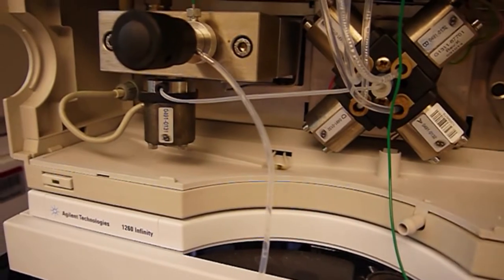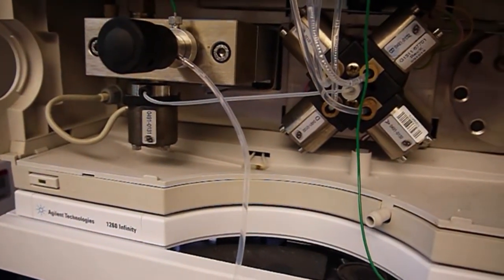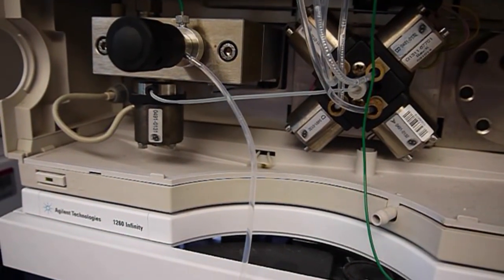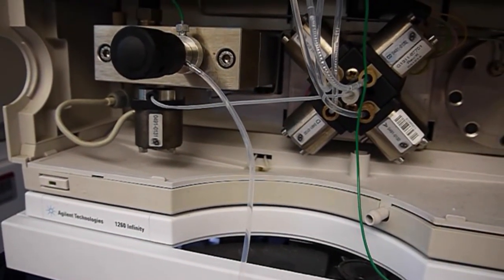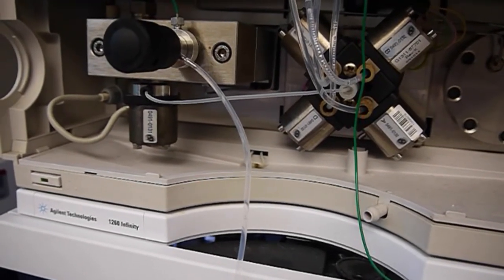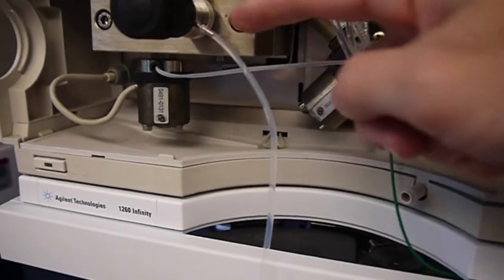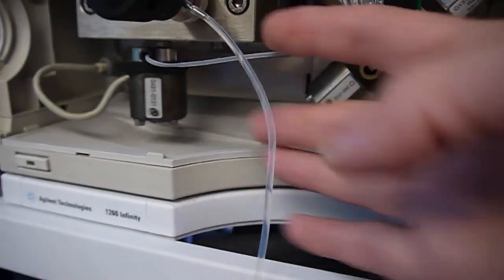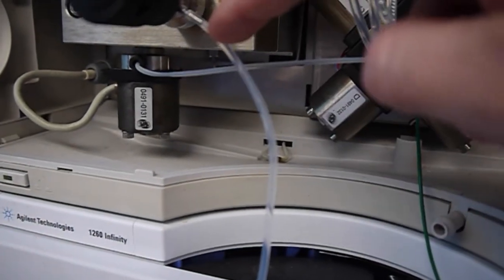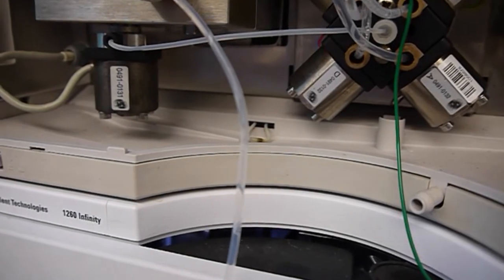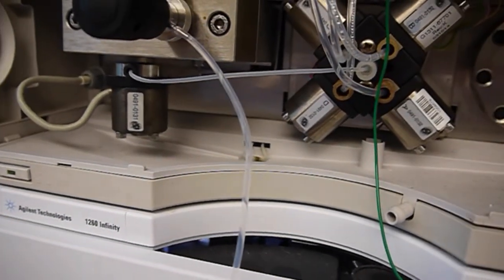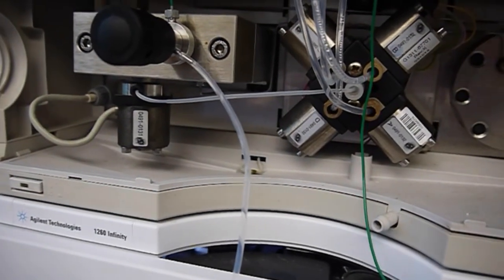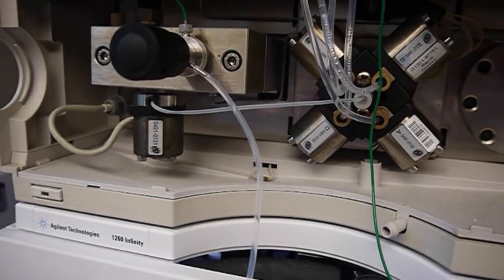Now the purge valve is open. You should see bubbles going through the tubing leading out the side of the purge valve. If you don't see bubbles, make sure the purge valve is open enough. The other thing is that the solvent could be completely in the tubing. We're going to purge for a little while to make sure that we don't have any bubbles in any of the line, in the pumps, anywhere like that.